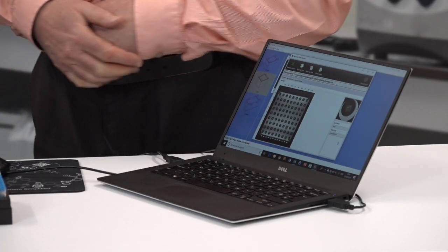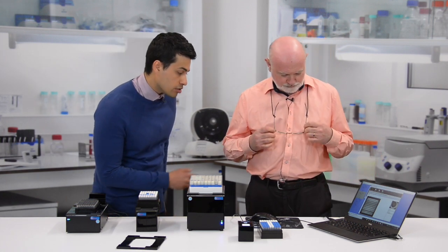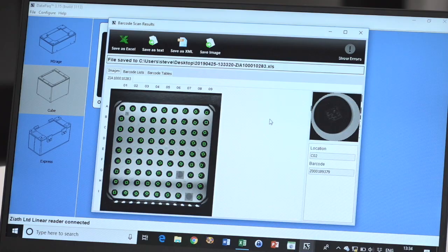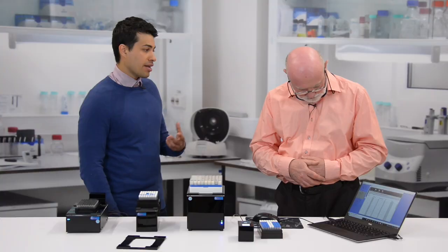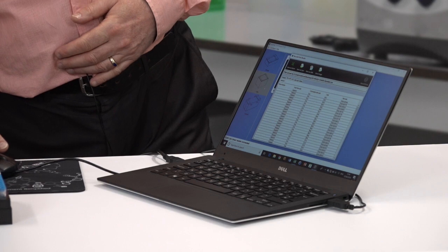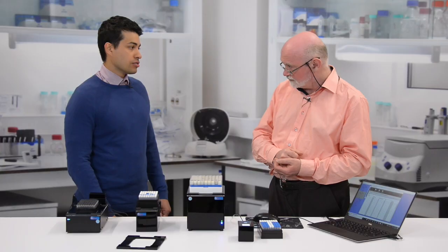Can I export this data in some kind of tabular format? Yes — on the second tab there's the barcode list, where all of the barcodes are tabulated from that read. You can export that data in a variety of formats: Excel, CSV, JSON, to name a few. There's also a Scan to Excel button directly at the top, which takes the scan and immediately exports it, and you can save that to any place on your computer.